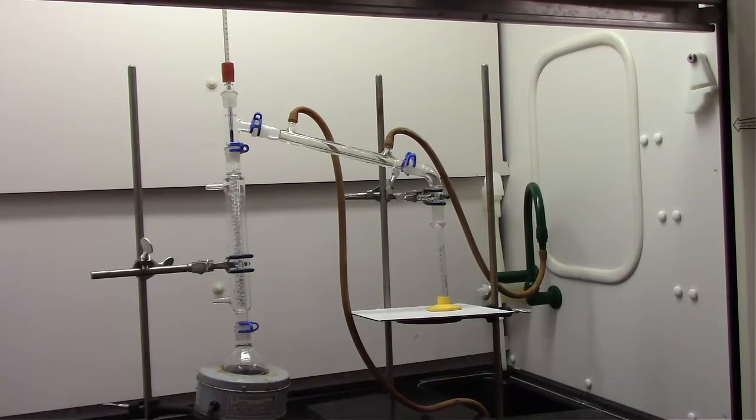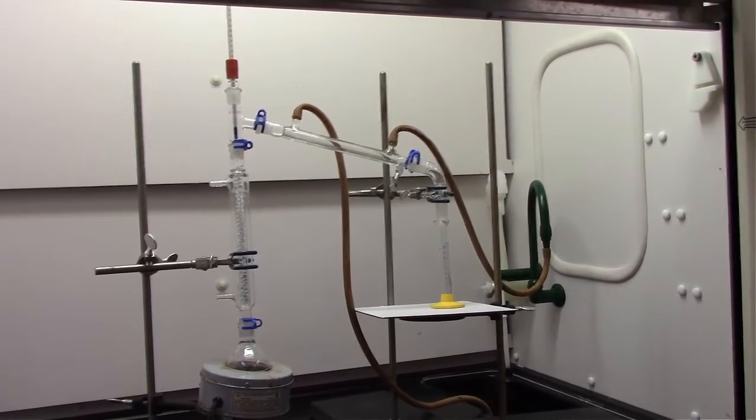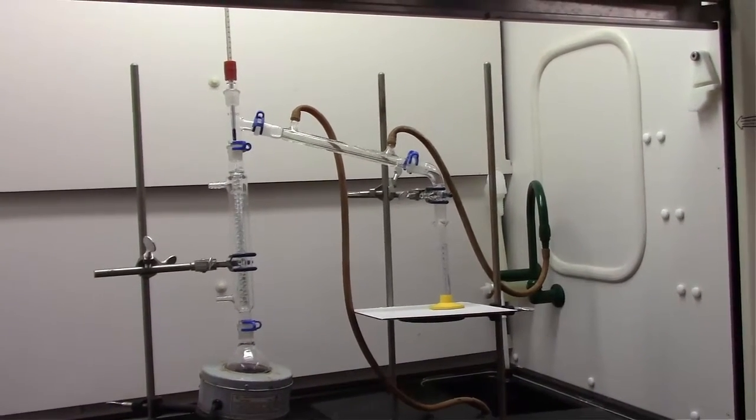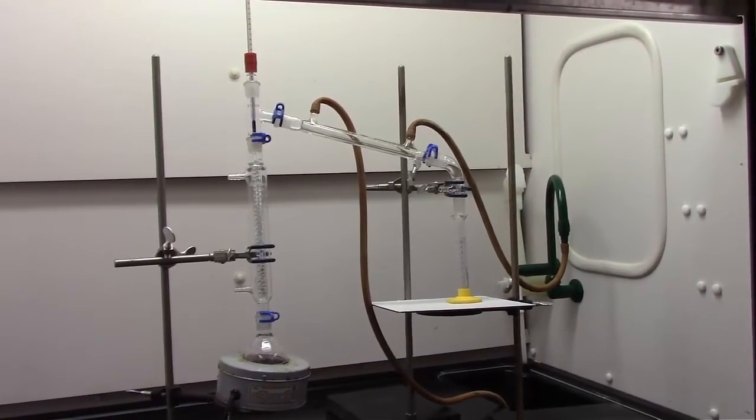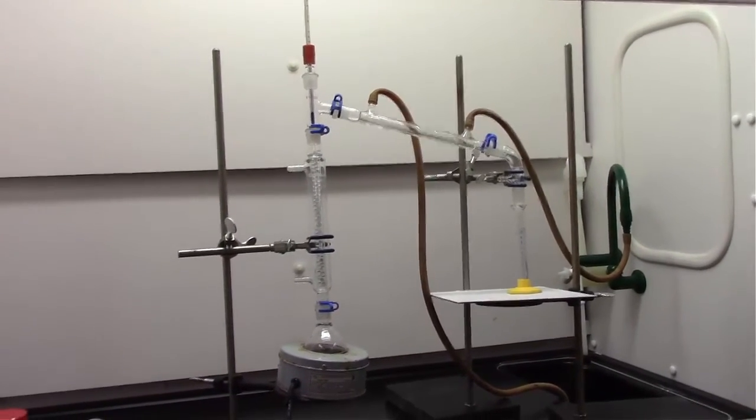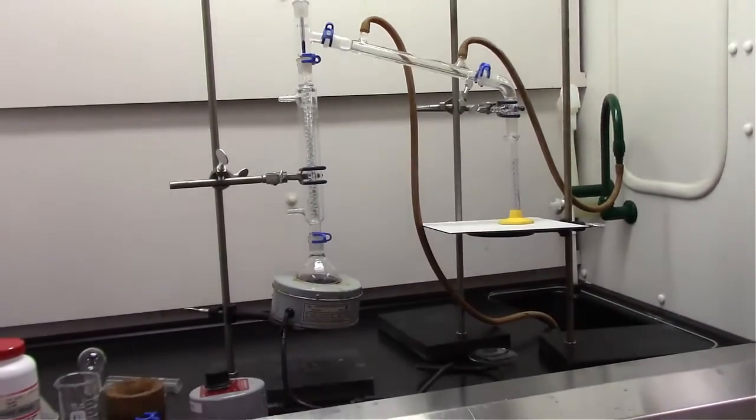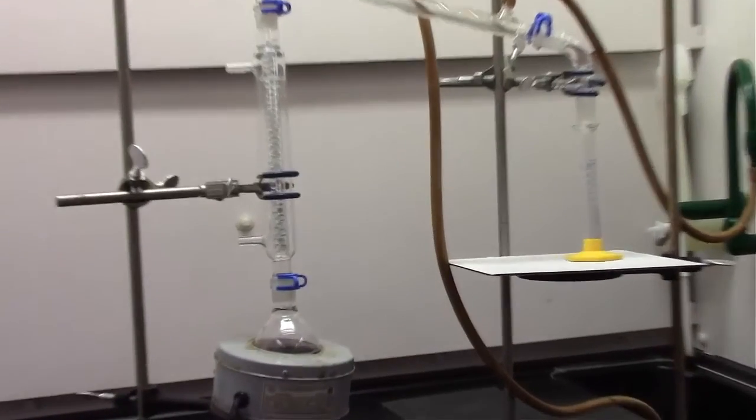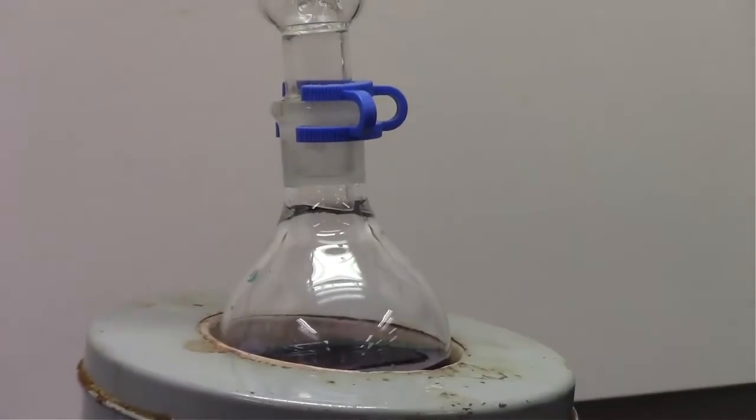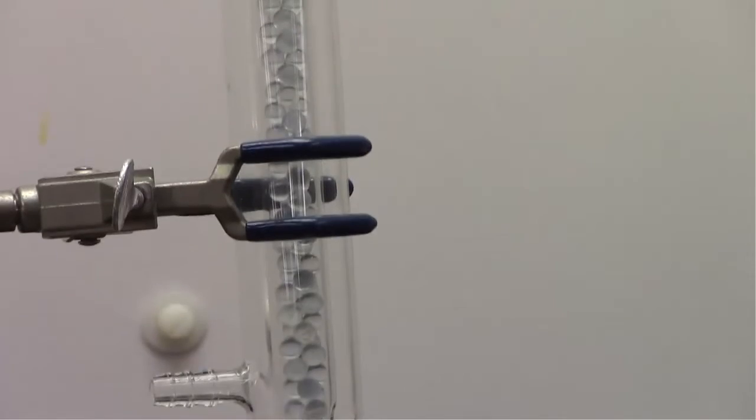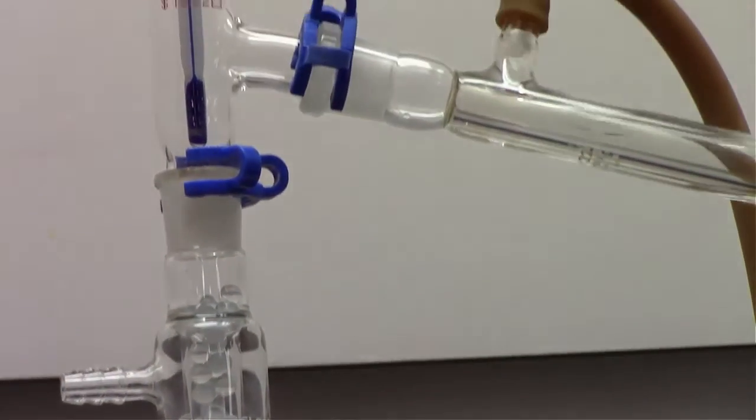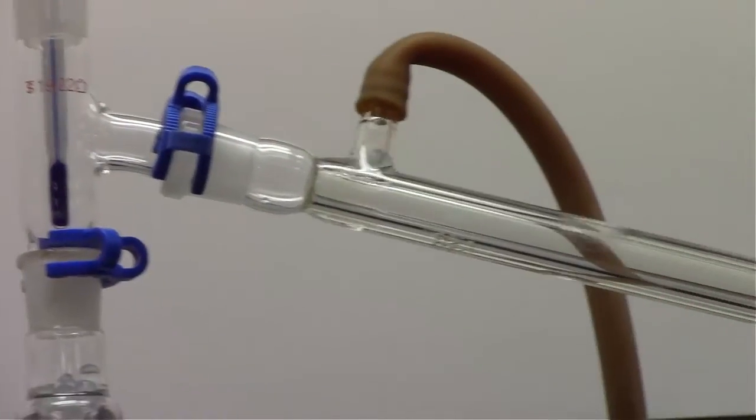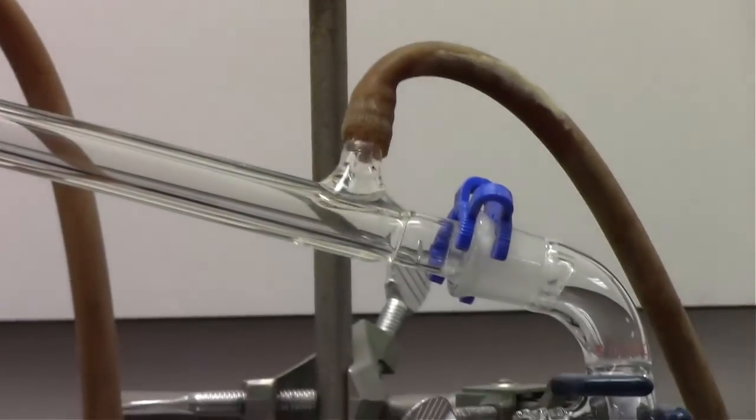Right now we have a fractional distillation set up, and we have beads in the condenser connected to the round bottom flask with our solution in it. So, fractional distillation offers more area, more distance for the evaporation condensation cycles to happen, meaning that we can ideally get better separation between the two liquids that we are trying to separate.